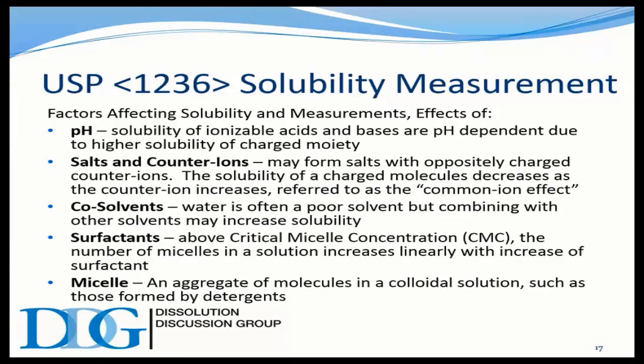So what does it mean the asymptote is reached during dissolution? The asymptote. In a dissolution profile for a sustained release product, you see the dissolution rate going in a linear progression, a zero order release. But in any type of dissolution, the drug is eventually going to be all dissolved.